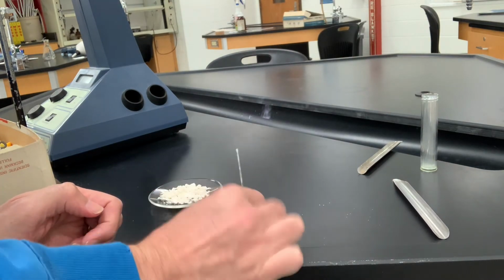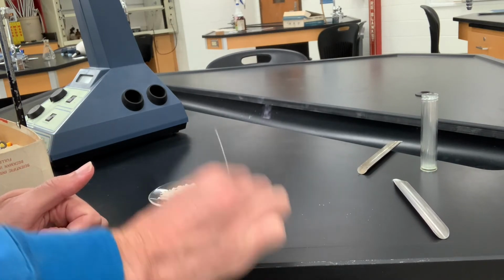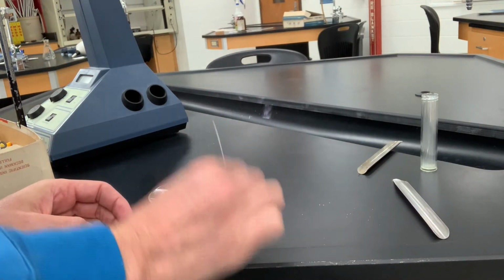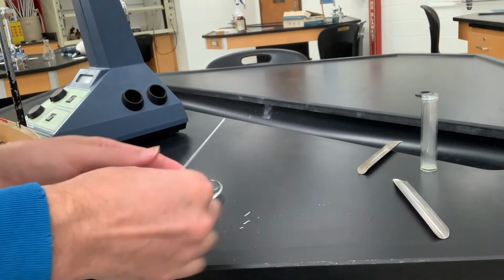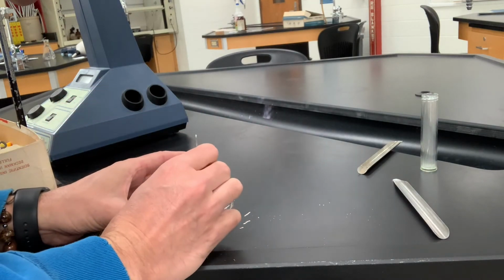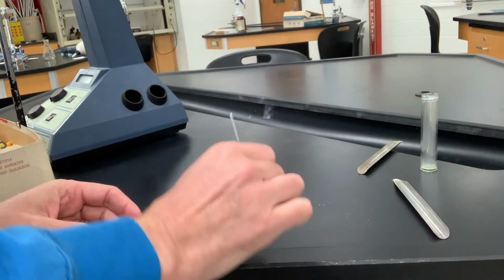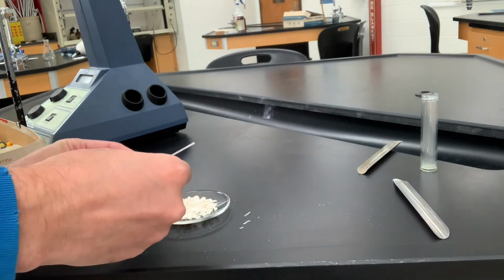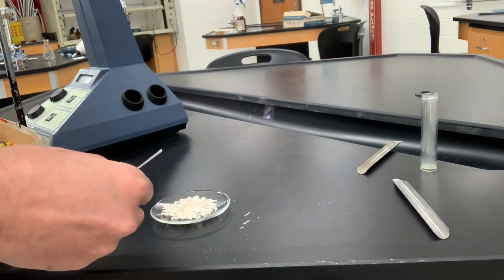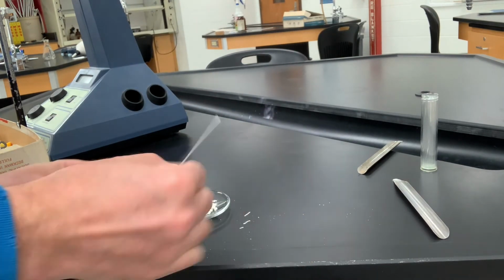Sometimes jamming in the full amount at once doesn't work, and you have to do it in portions, a millimeter at a time or so. This material doesn't seem to be falling down too well. Yeah, it just came out again. Got about half of what I need in there right now, so let's try to get the other half in. Gotta be careful when doing this. Sometimes you can crack the glass and it can stab into your thumb or something, like that blood test they do.